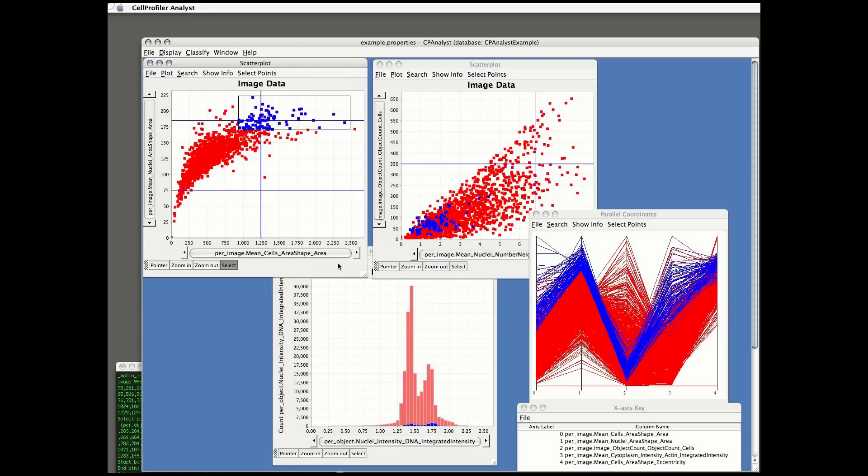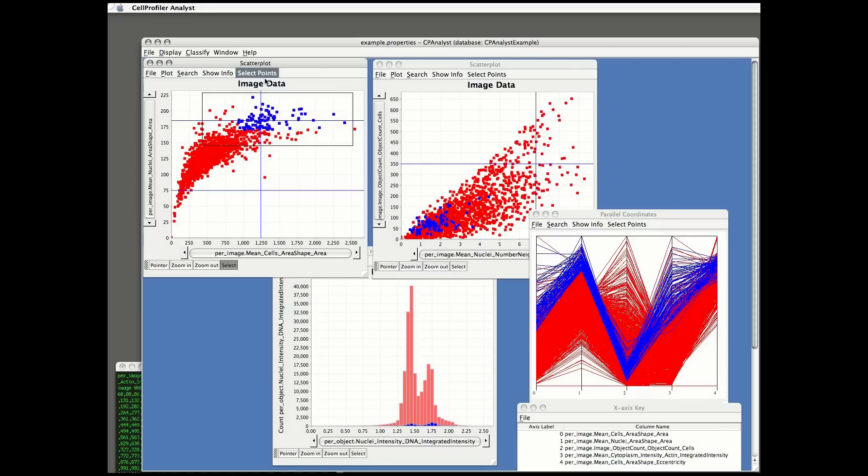Note also that even in the histogram, which shows individual cell data, the data is linked. And in blue are those cells from images that I've highlighted in the scatter plot. So the scatter plot shows whole image data, and the histogram shows individual cell data.